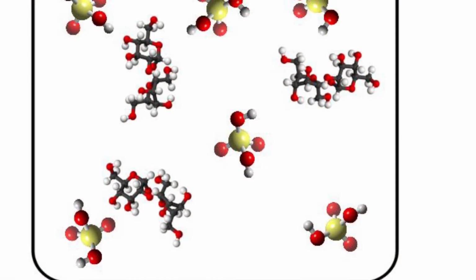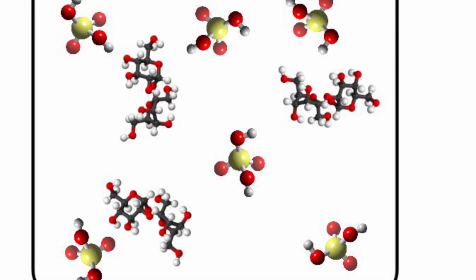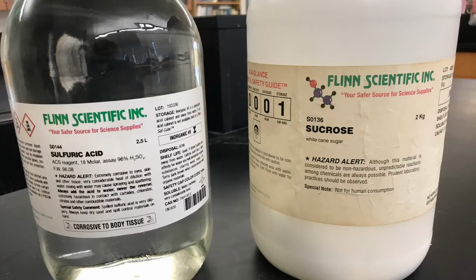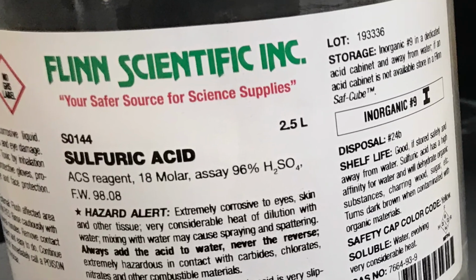And nothing. After half an hour, all we have is a thin layer of carbon. The problem is that our sulfuric acid isn't concentrated enough, even though it's 12.5 molar. In other words, instead of this, we need to make our beaker look like this. It's time to upgrade our materials. For the next trial, we'll use lab-grade sugar and some seriously strong acid.